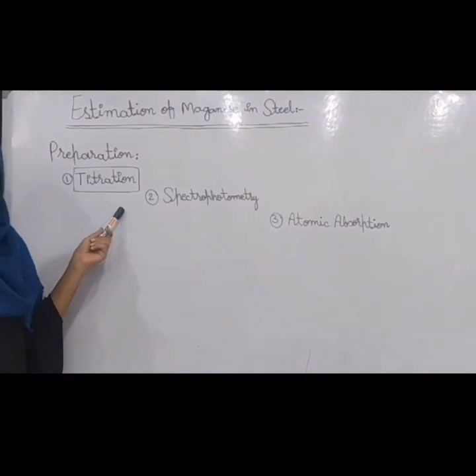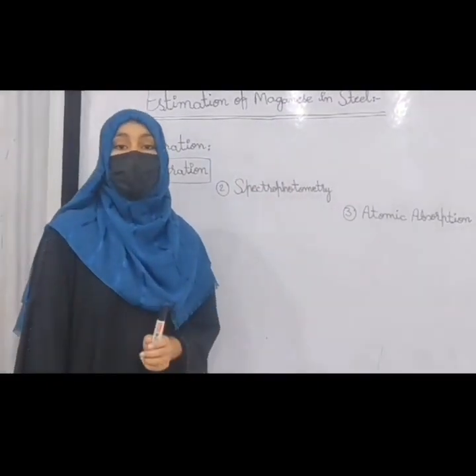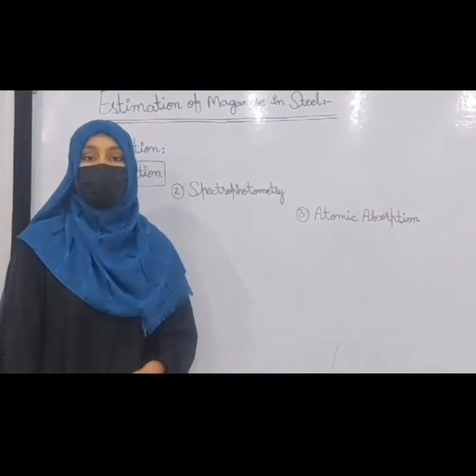Why have I selected the titration method? I have a reason. Number 1, it is cost effective as compared to the other techniques, and number 2, it is a precise and accurate measurement.